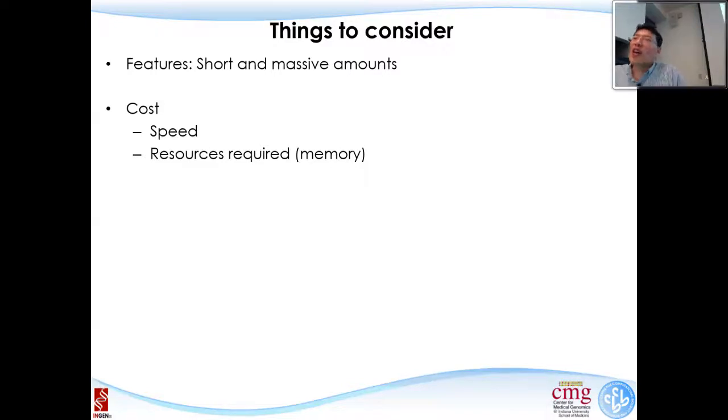Someone did a calculation in the very early phase of next generation sequencing, when the data was 100 times less than what we have now. If you use BLAST, which is the normal way to do sequence alignment, it needs something like 300 years to align one flow cell. So it's not really feasible. The speed is really very important.